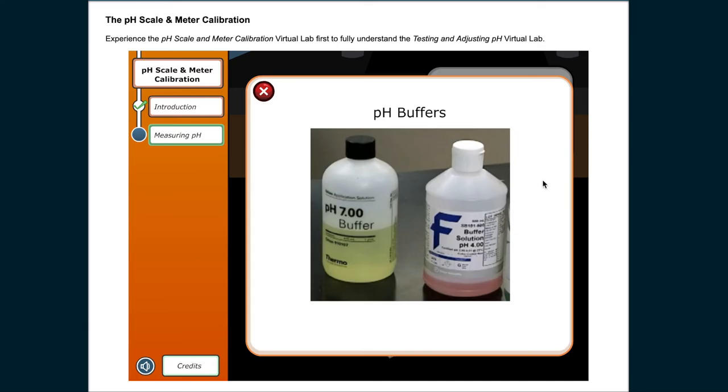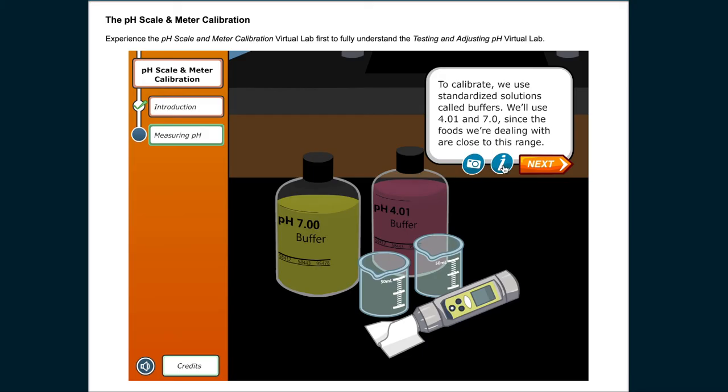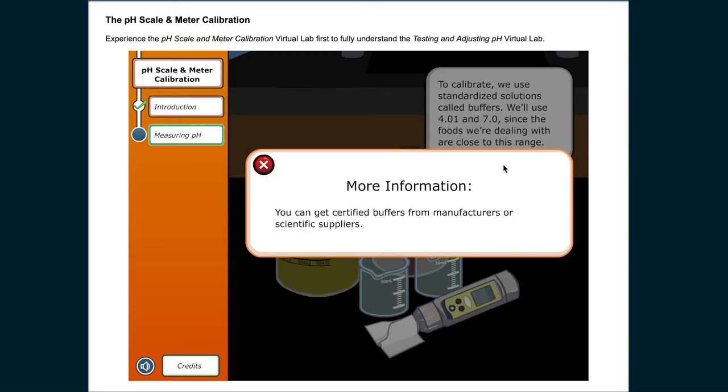pH buffers. You can get certified buffers from manufacturers or scientific suppliers.